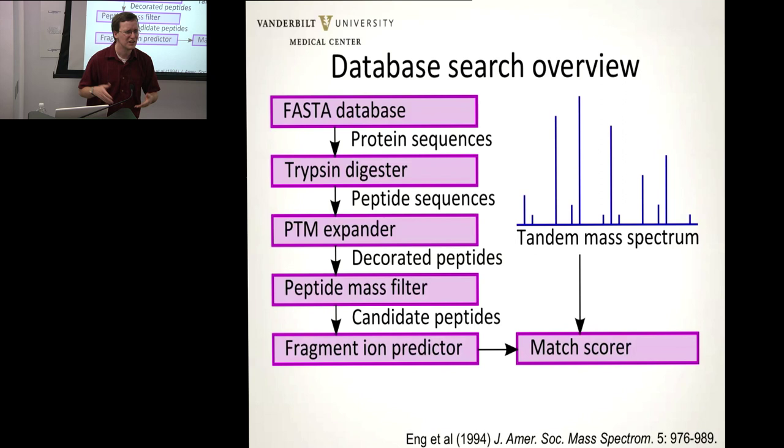The numbers vacillate around, and if you were to use the human subset from SwissProt versus RefSeq versus Ensembl, each of them has a different number of proteins that appear. At least they all point to roughly the same set of genes, so this is good. Some of them include every possible isoform, and some include just a minimal set. So you're going to find quite a variation there.